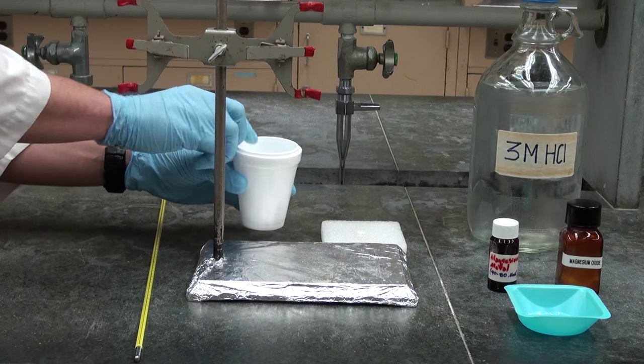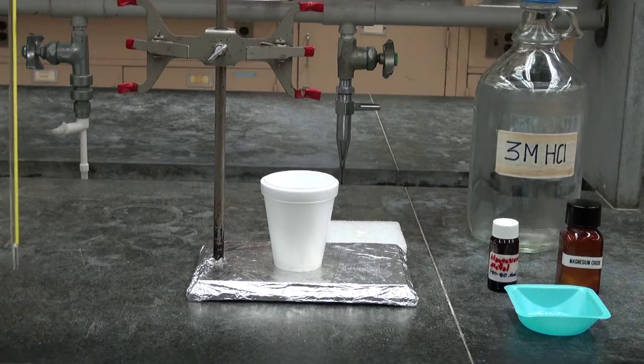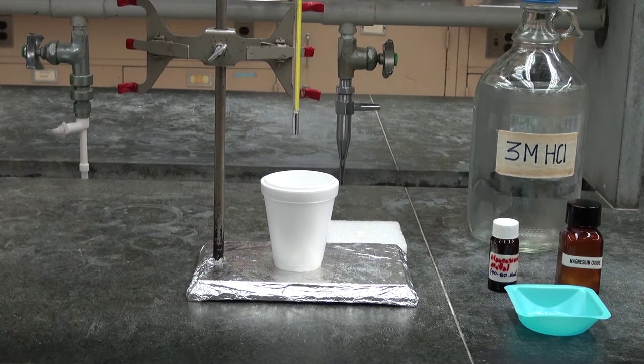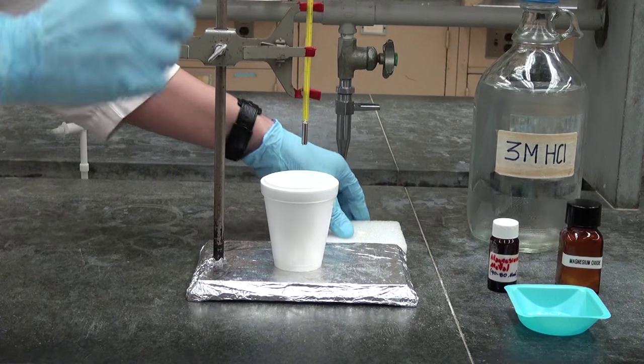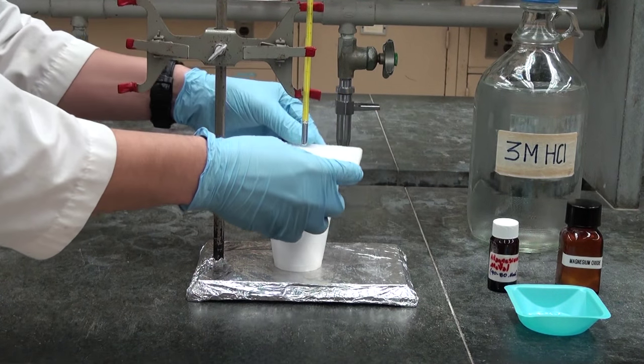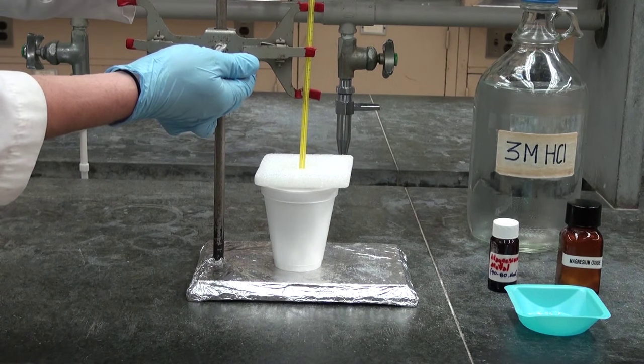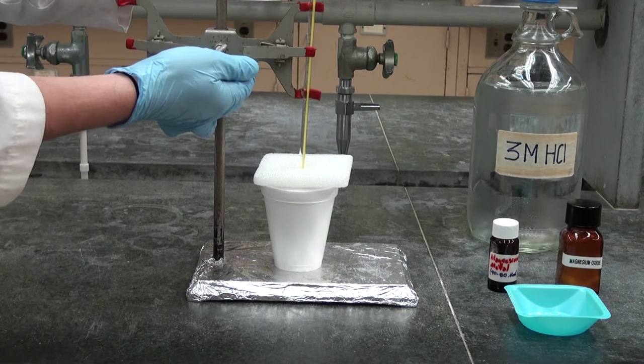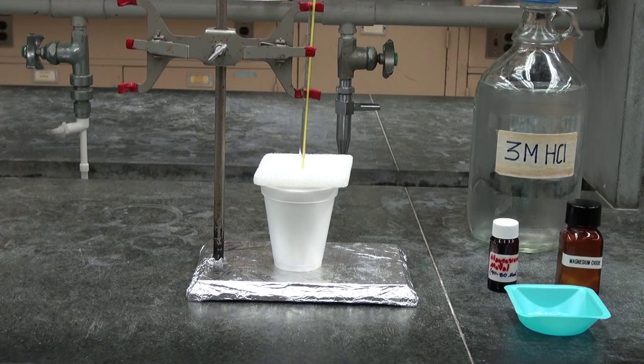We can set the coffee cup calorimeter up on top of a clamp stand. Into the calorimeter, we insert a thermometer—the longer the thermometer, the more accurate our measurements are likely to be. We can include a lid, all of which will serve the purpose of ensuring that the heat produced during the chemical reaction stays inside the coffee cup.